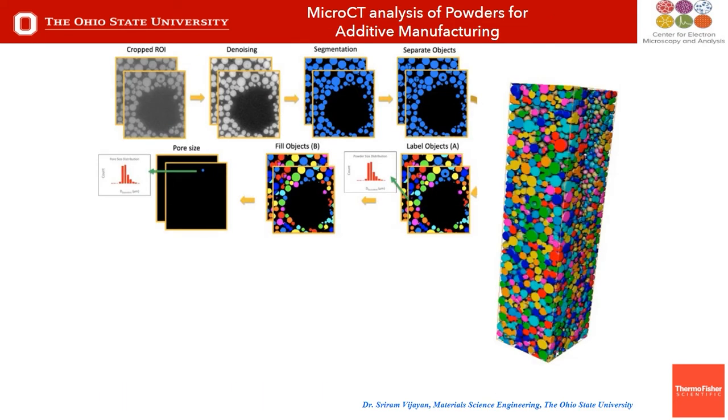And in that vein, additive manufacturing and 3D printing is one of the hottest fields now. A lot of people are just going out to different centers or stores and buying 3D printers and putting them in their house. And when you do that, you need to understand the material that you're putting into it. The assumption is often that if you were to take a piece of metal and put it in a 3D printer and print it out, a lot of people would think, well, I have the same properties that I have if I have a conventionally forged or fabricated material. And that's not the case.